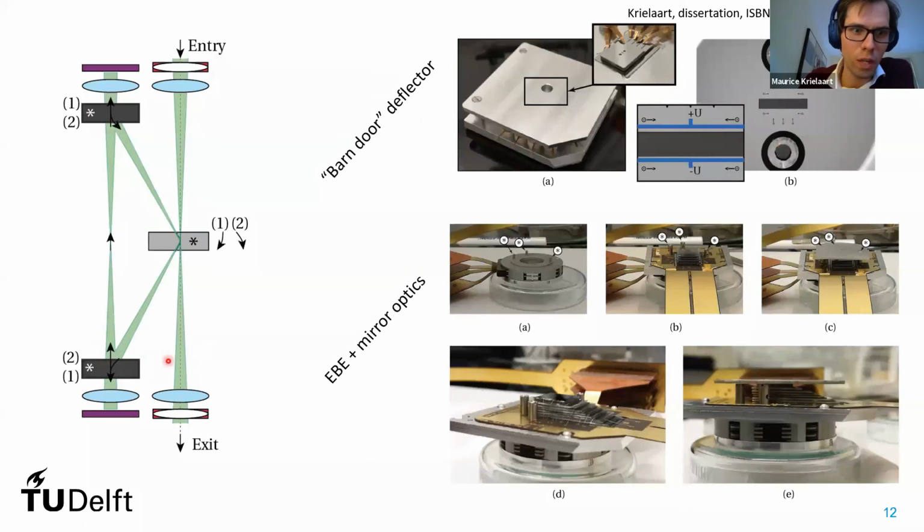And then because these two axes are so close together, also this miniature deflector over here, which must combine an electric and a magnetic field to realize this direction-dependent deflection path, must also explicitly take some room to let the electron pass as it propagates over this axis here, because it's just a millimeter apart. We have a whole separate publication on that. I won't go into the details there, but here's just a photograph of that device. We've been building it over the last 2 years. We're really happy to see that really taking off now.